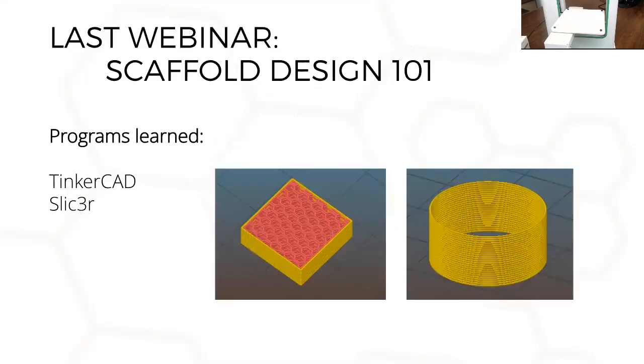So in the last webinar, we did a really basic scaffold design, using very simple tools such as Tinkercad and the Slicer program to walk you through how to create a 3D model, and then using Slicer to design the different infill patterns that you might want to customize in the scaffold that you want to print. And also something as simple as creating a cylinder. How do you adjust the thickness of the cylinder and whatnot? That was basically what we did in the last webinar. And we also did the prints using a very simple material called Pluronic, which we'll show you shortly as well.